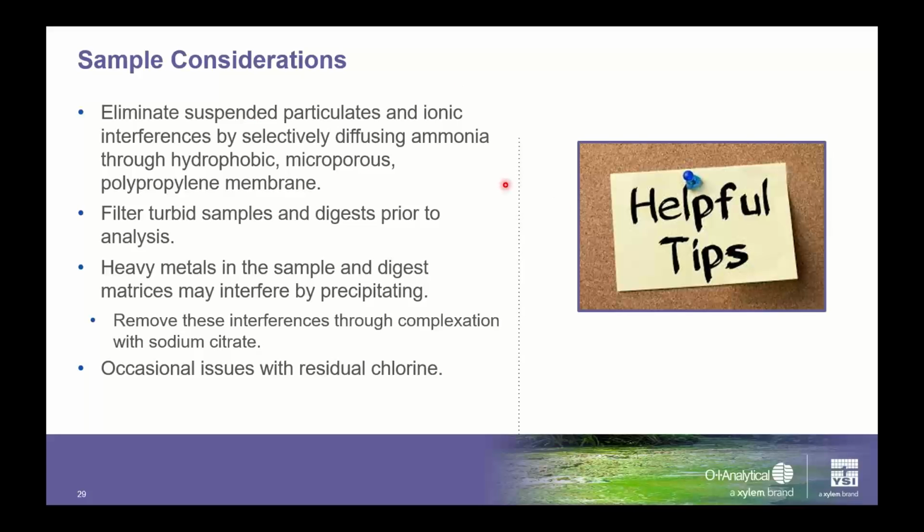So this aligns very nicely with the EPA's requirements for this method, but there are some things for you to be aware of that Tim wanted me to warn you about, because he has done this hundreds of times. He says that the TKN method does use a hydrophobic membrane, and so you really have to be cognizant of how that might interfere potentially with things in your sample. You need to filter turbid samples. If you're getting samples directly out of the environment or from certain steps in your wastewater treatment process, you might need to filter them. He recommends filtering with a 40 micron Whatman membrane.